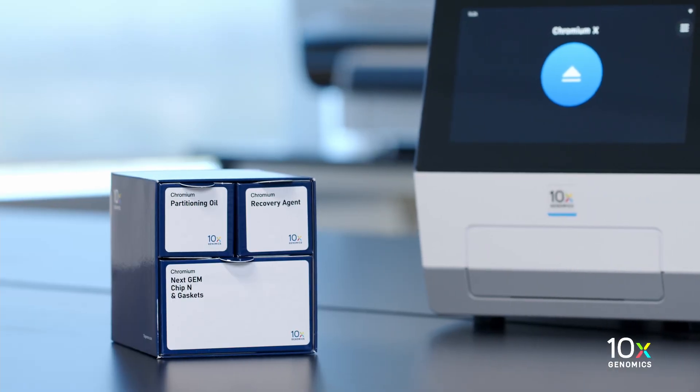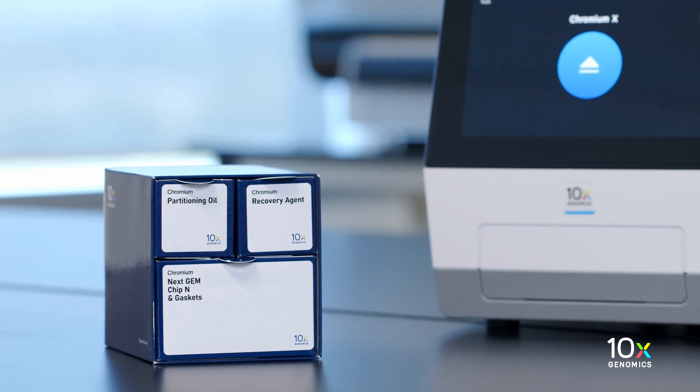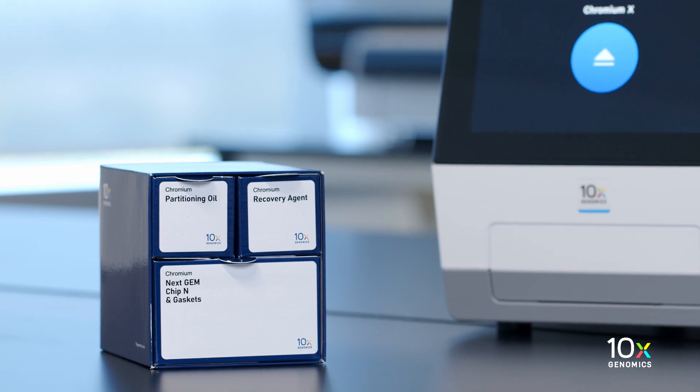The Chromium NEXTGEM Chip N Single Cell Kit is stored at ambient temperature and contains Partitioning Oil, Recovery Agent, NEXTGEM Chip N, and Gaskets.